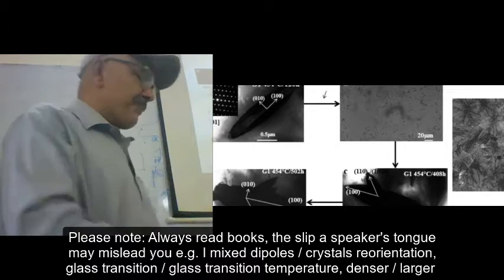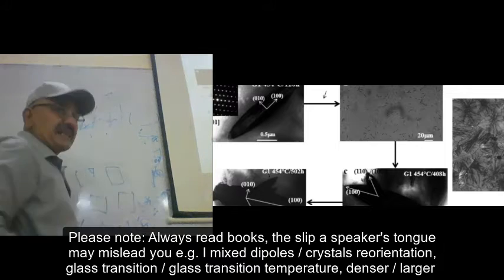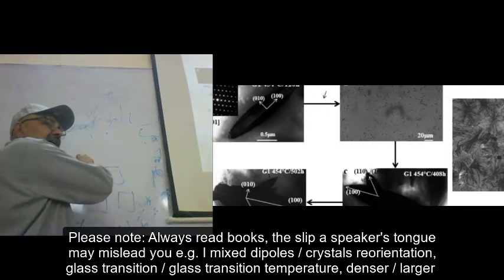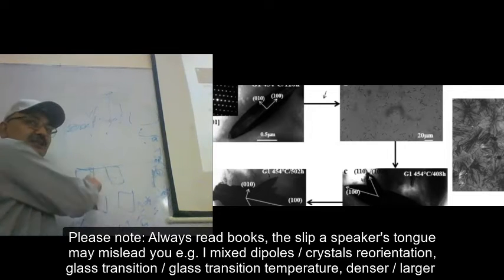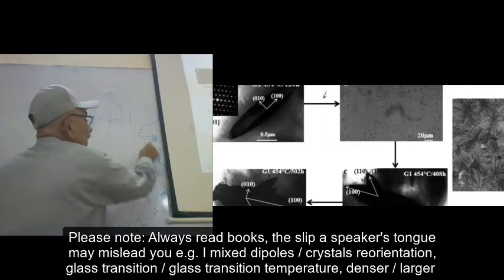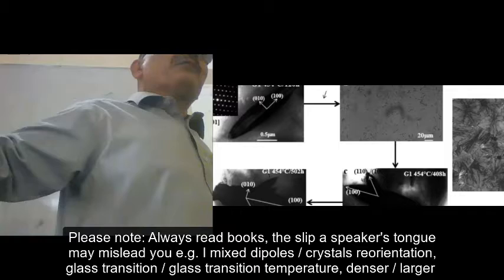The crystals are usually like this, but what the students do is they increase the image in one dimension more and leave the other the same, and these nearly cuboidal crystals appear like this when you expand one dimension and leave the other the same.